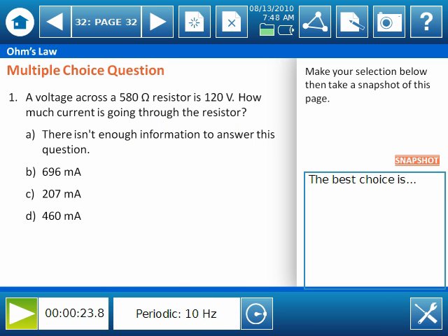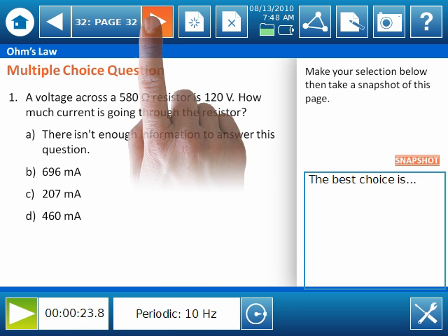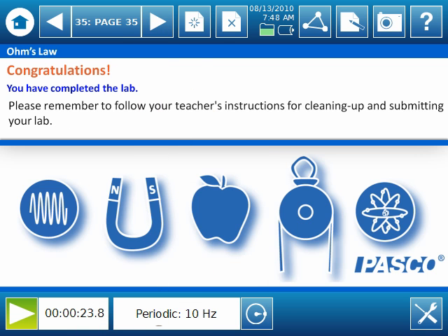The multiple choice questions are designed to resemble those found on standardized tests to help students prepare, and each lab has a clear end page.